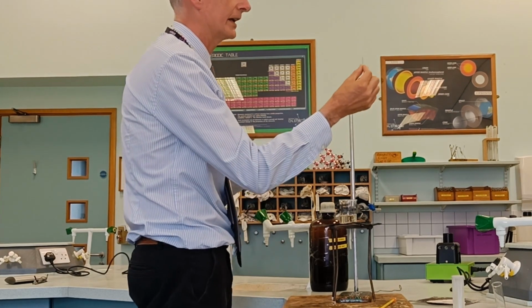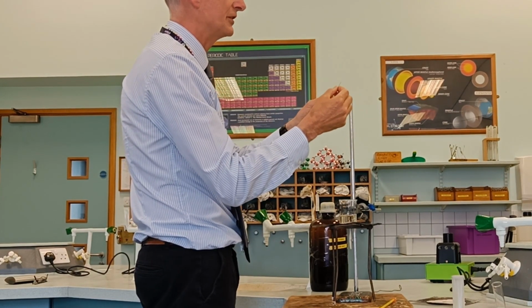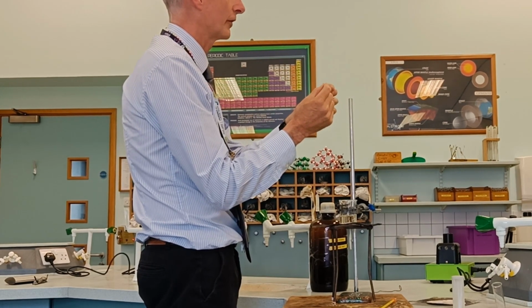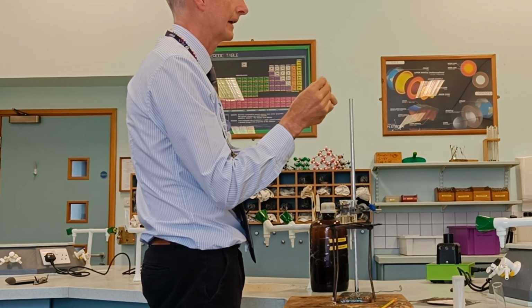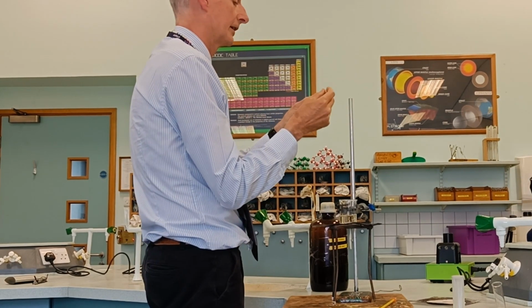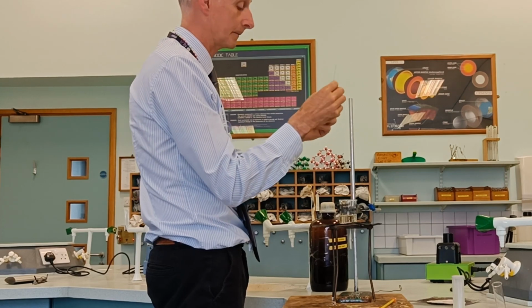Well, the sample is put into a capillary tube. Most capillary tubes are open at both ends. We've got some here which are closed at one end and open at the other, and you can feel which one is closed because it's smooth. If it wasn't closed at one end, we'd have to close it by melting it, but we don't need to worry about that. It's open at this end.